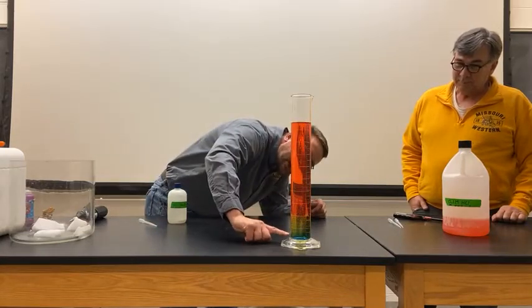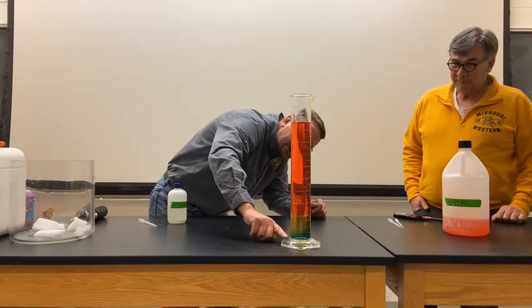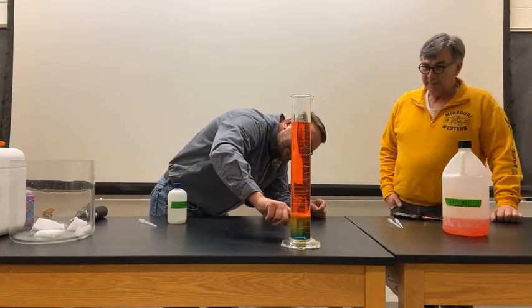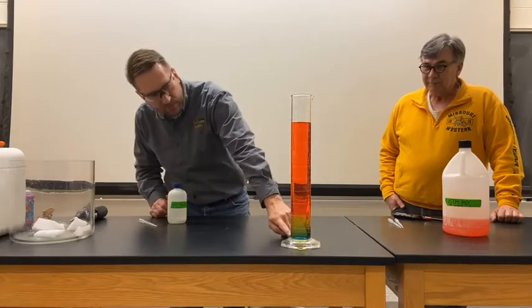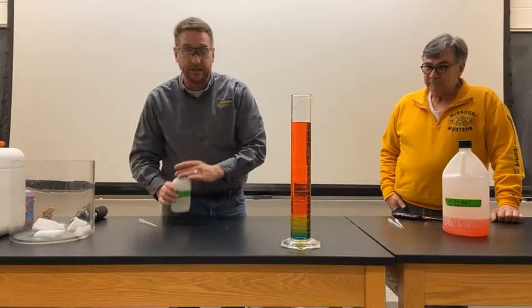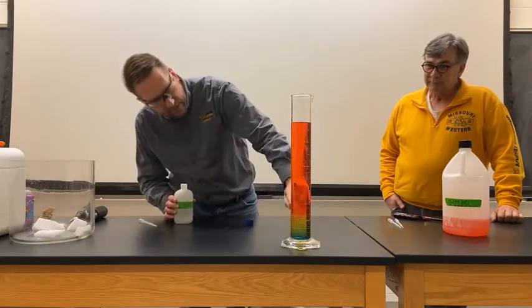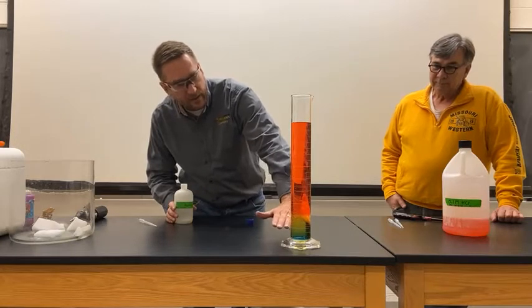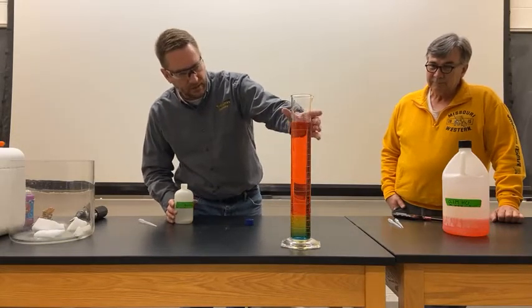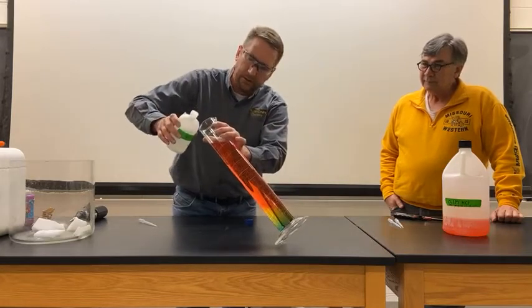So you can see the dark color down here at the bottom, and that is sort of a bluish color, and then our yellow, we'll see a little bit of orange in here, and then red. So this is where it is basic, because sodium carbonate is basic. And then it gets increasingly acidic as we move away from that very dense area of sodium carbonate up into our hydrochloric acid layer.